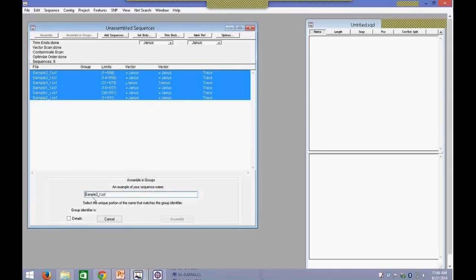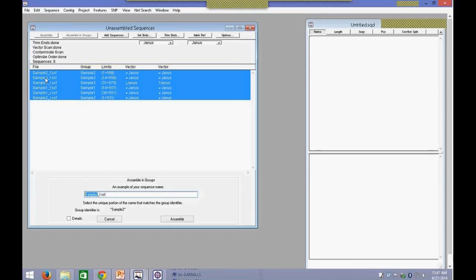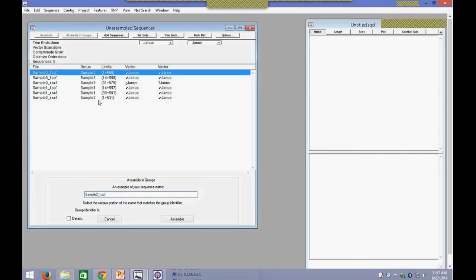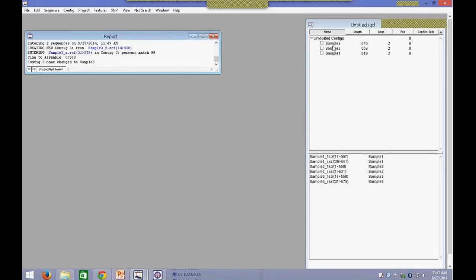Once you've done your vector scanning and trim ends scan, you're ready to do the assembling groups. To run assembling groups, highlight your sequences and click on Assemble by Groups. This will open a new window at the bottom where you specify a common file name for grouping — a naming convention. Here if I highlight Sample 2, it will take that as a sample name and use it as a template for making groups. So Sample 2 forward and reverse will be added to the Sample 2 group, Sample 1 forward and reverse to Sample 1, and Sample 3 to Sample 3. Once you've specified your groups, click on Assemble and you'll get three groups with your reads in them.